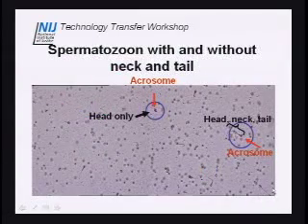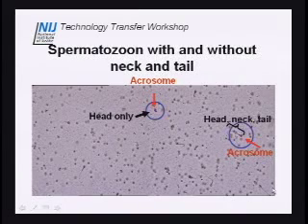Okay, so I might be hitting you over the head with this, but the acrosome is, to me, the important feature for identifying your sperm head without its tail. Lots of times when you look at these differential slides, there might be yeast on the slide, there might be red blood cells, just a pink blob, you don't know what it is. So you want to make sure, because this is what we're cutting now to help separate our epithelial cells from our sperm cells, I do a fine focus and really try to make sure that that head has that clear acrosome on top. And that's it. Any questions about the basic cell identification?